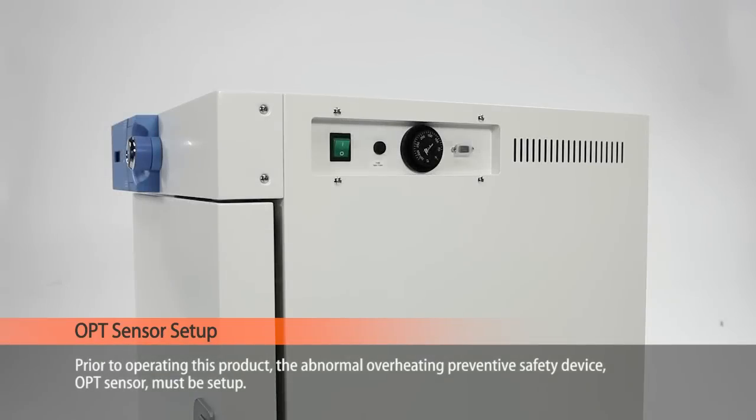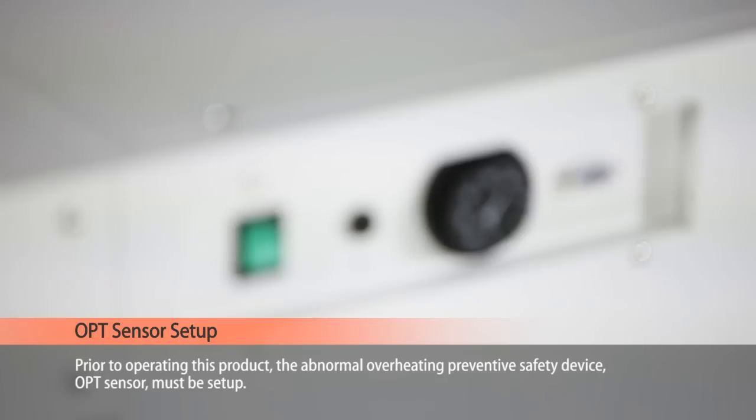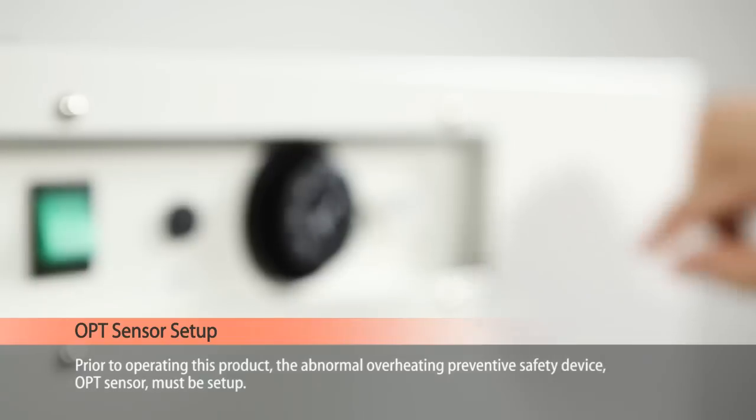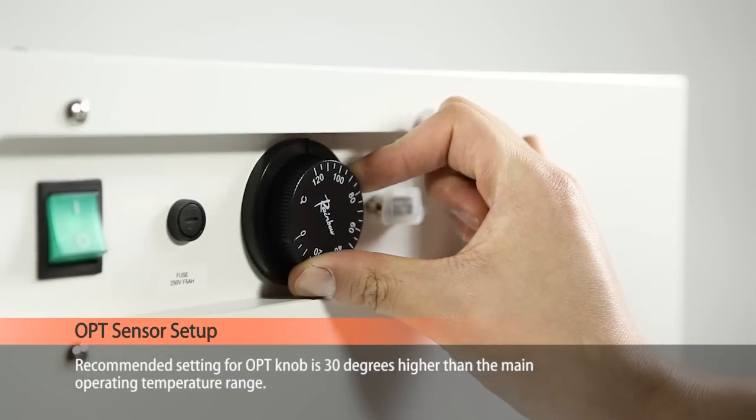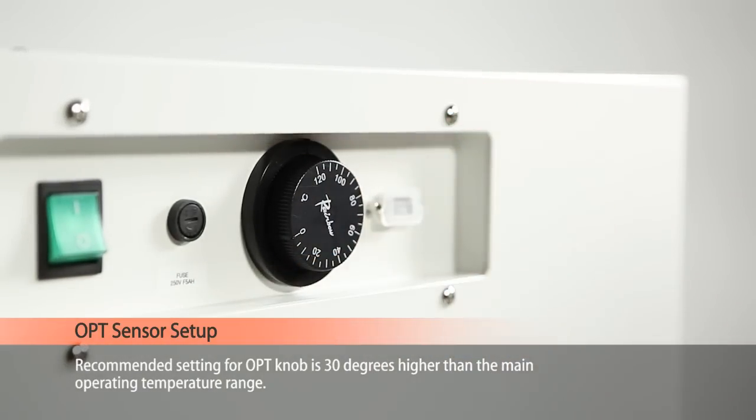Prior to operating this product, the overheating preventative safety device OPT sensor must be set up. The recommended setting for OPT is 30 degrees higher than the main operating temperature range.